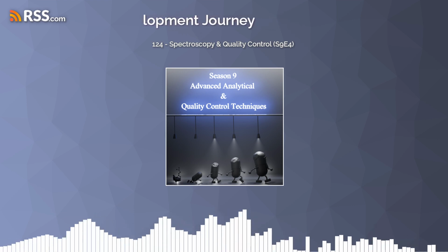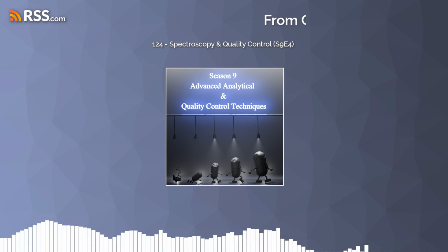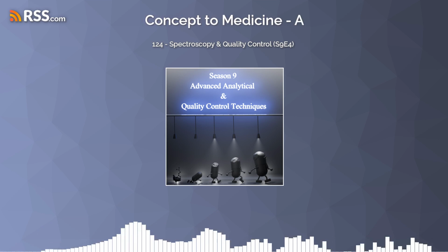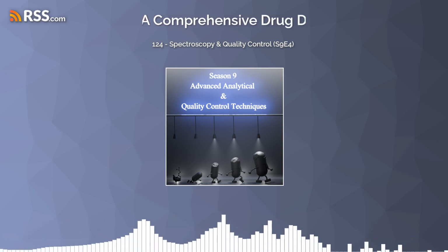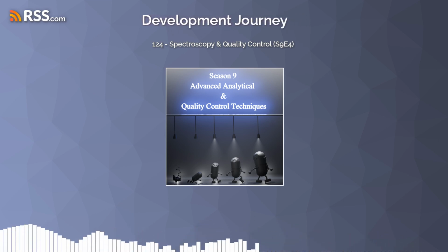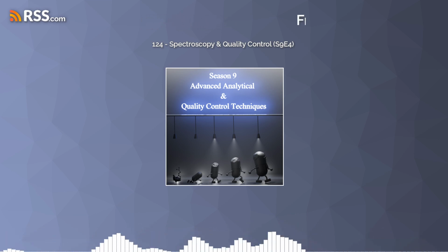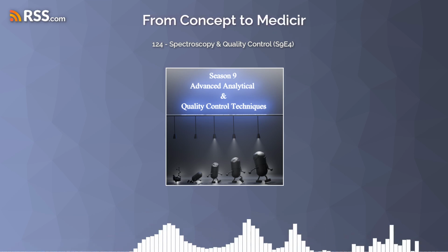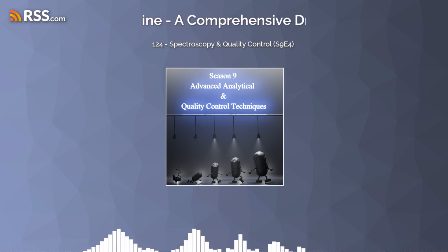So really what UV-Vis lets us do is get a really reliable head count of the molecules that we're interested in. So you can use it to identify what's there and how much is there. Kind of like shining a light through a colored solution and seeing how much of that light gets through. And based on that, you can get a feel for the concentration. So UV-Vis is kind of like a molecular fingerprint based on how it absorbs light, and it's used to identify things and quantify, right?